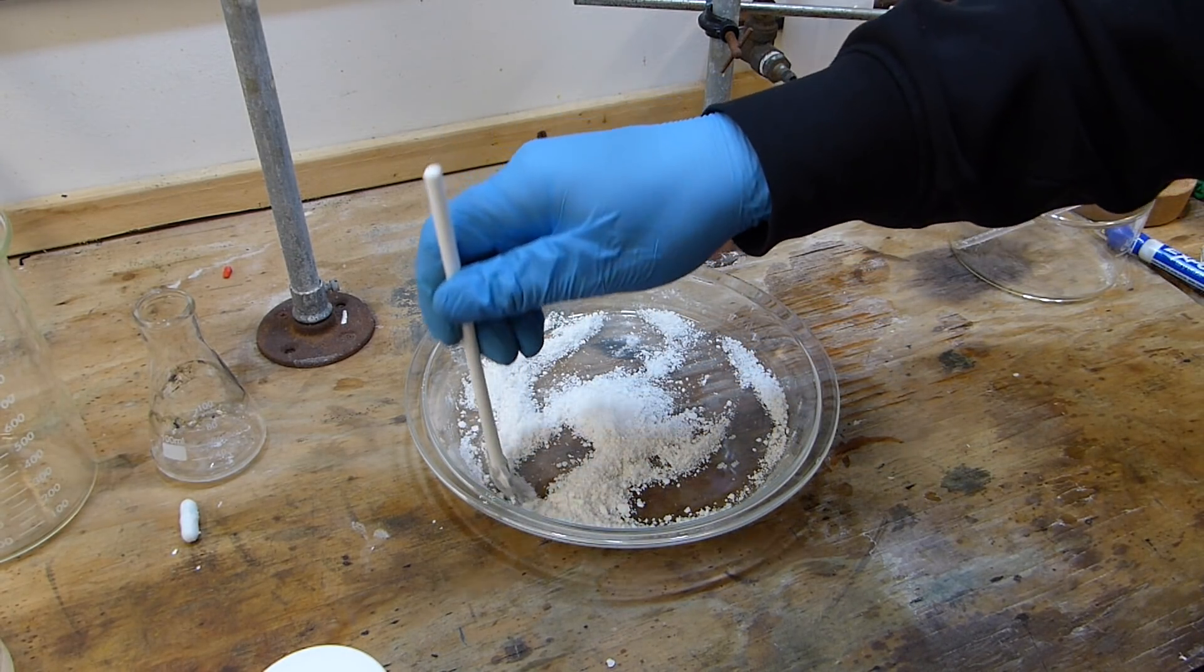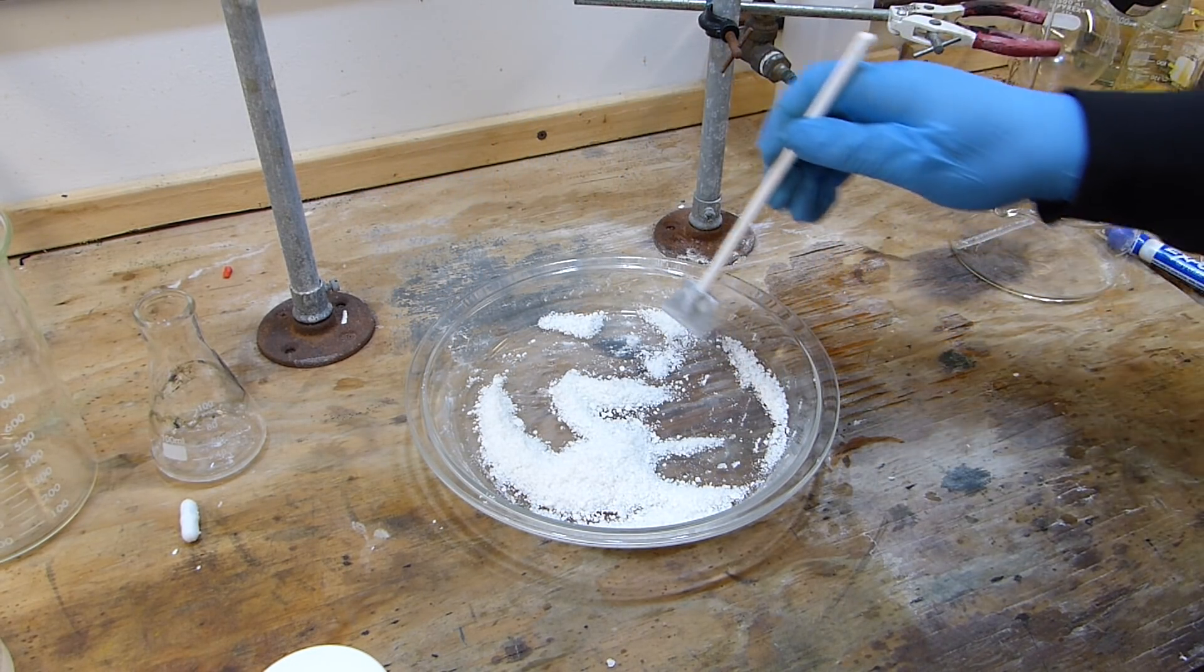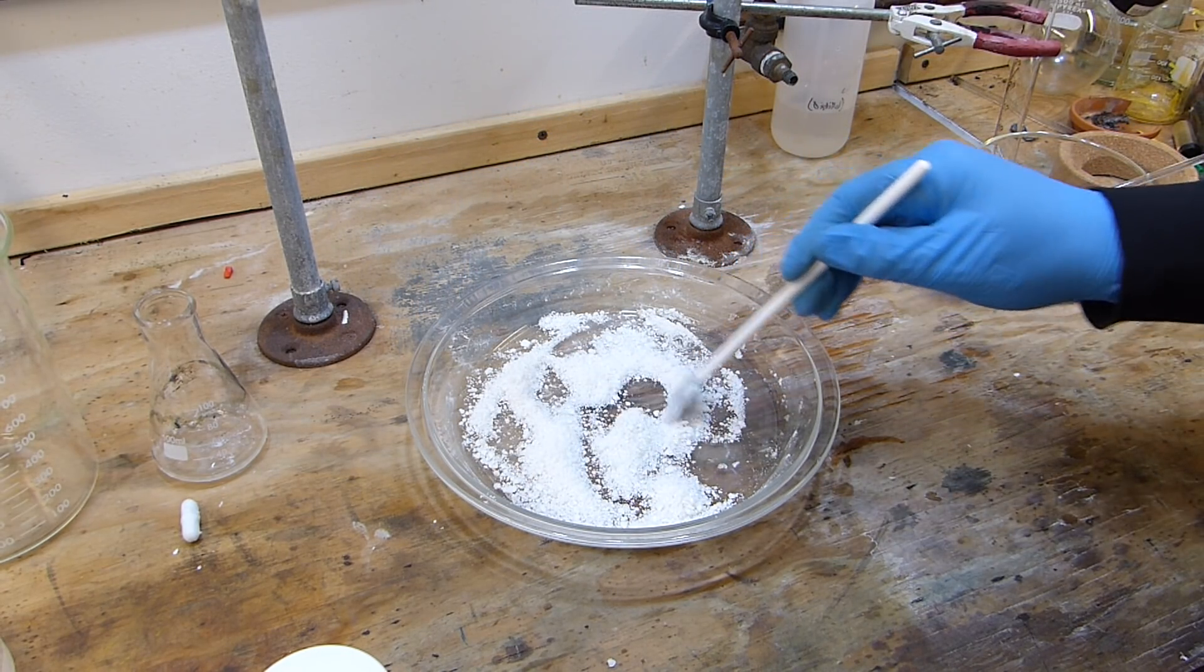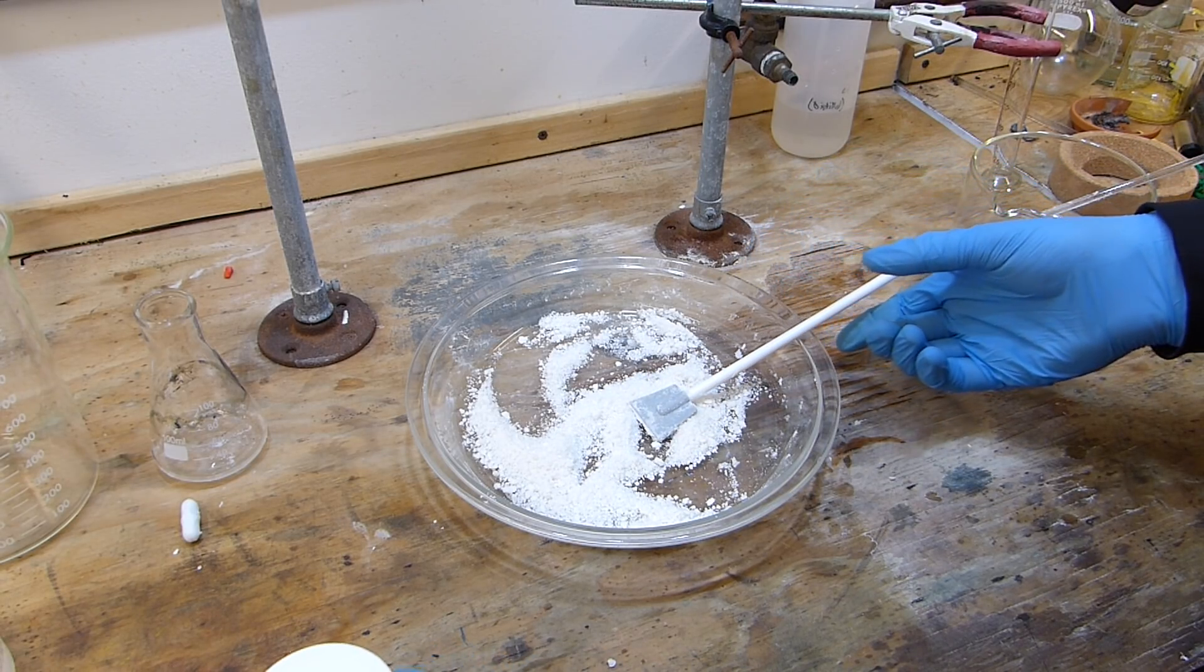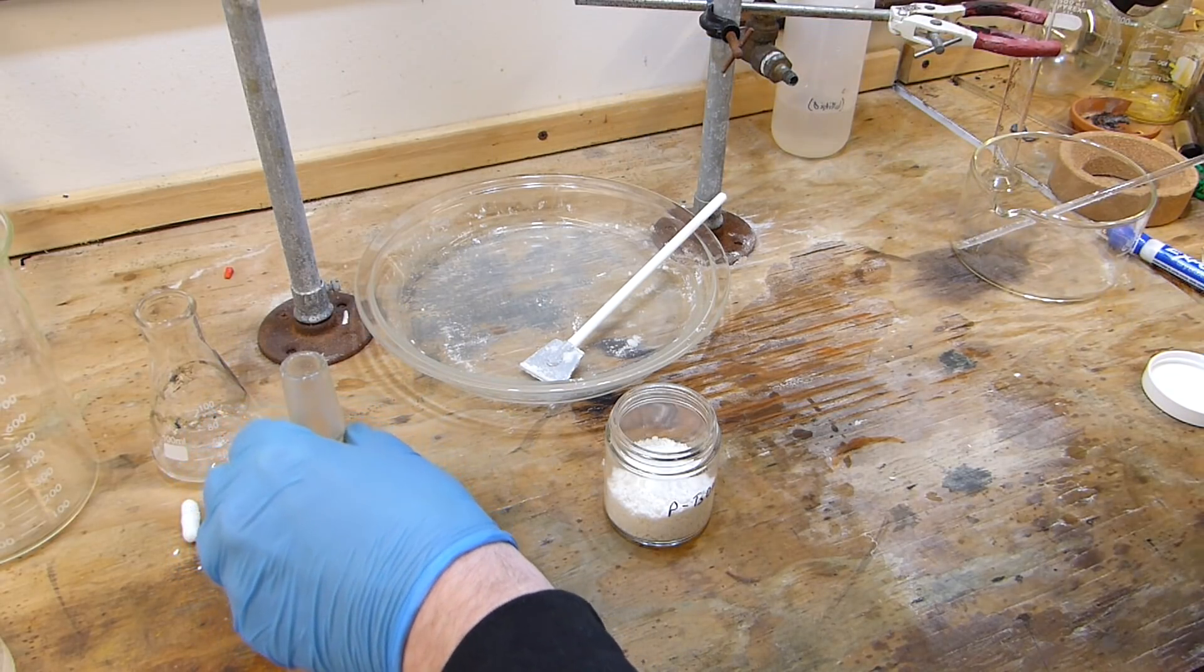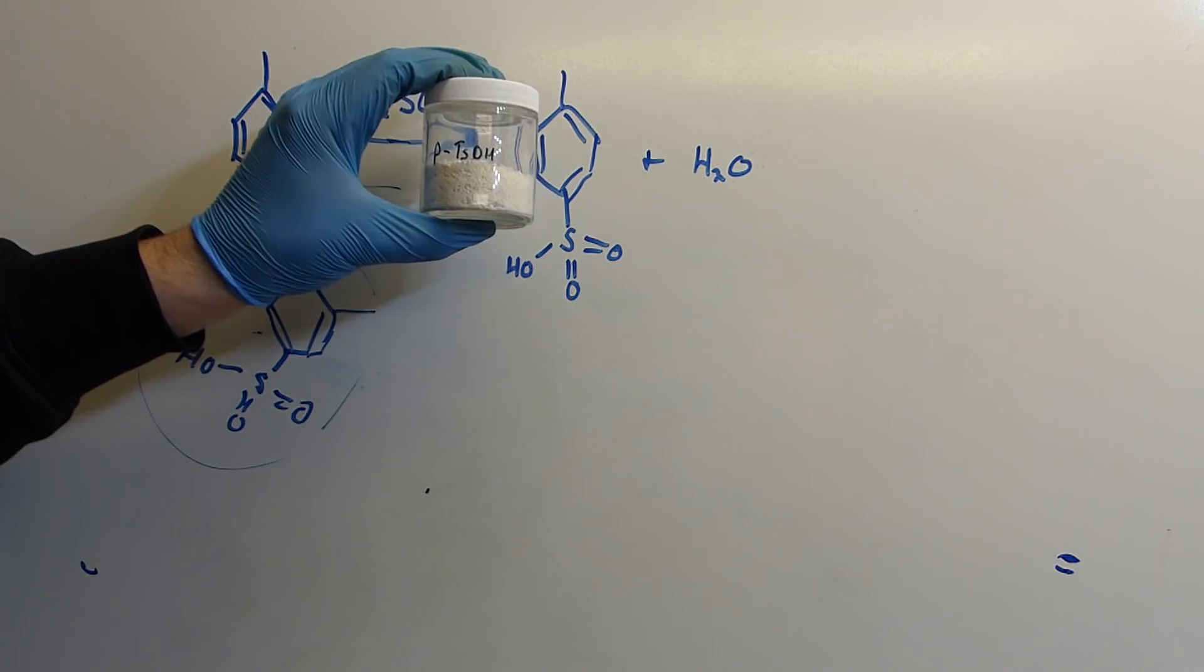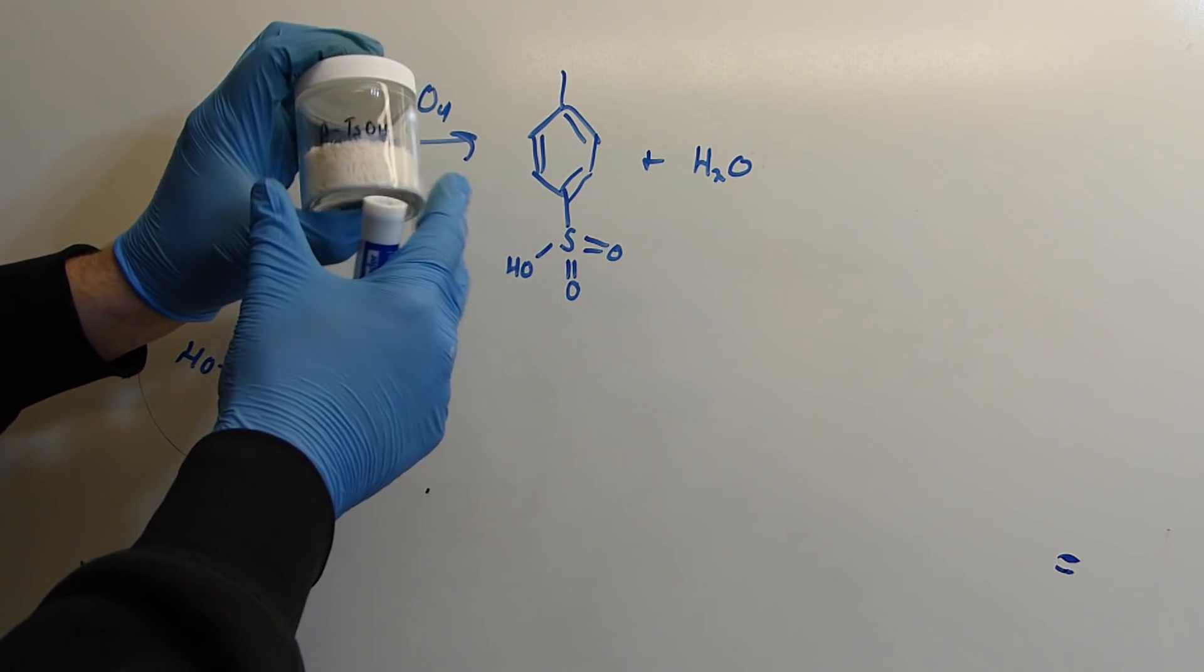After a few minutes of continuously pushing this around you can see that the product here is pretty much completely dry. Unlike what a lot of procedures call for through various books, a vacuum desiccator is not strictly needed for this. You can see this is pretty much almost completely dry already. You simply melt it and stir it around a whole bunch and it will eventually dry on its own at room temperature. Anyway this is just going to go into this container now. Here's the final product, it is a lumpy crystalline white powder, maybe slightly off-white because of some impurities, but this could also be recrystallized. I'm not going to do that because the impurities that are in this aren't really going to affect anything I'm going to use it for.